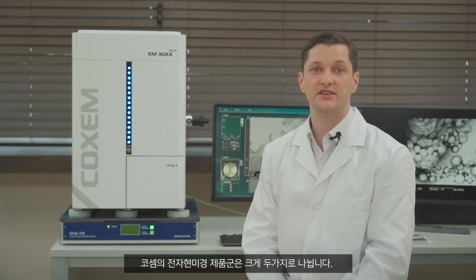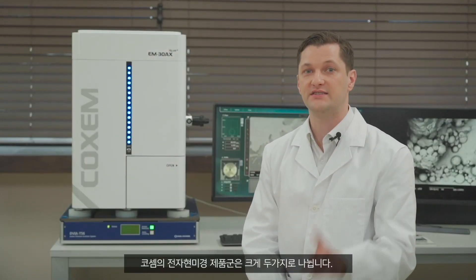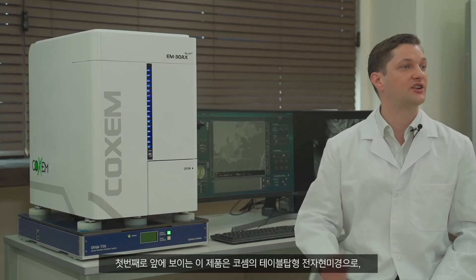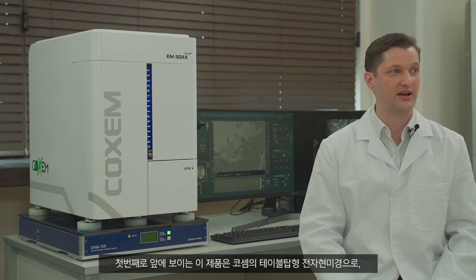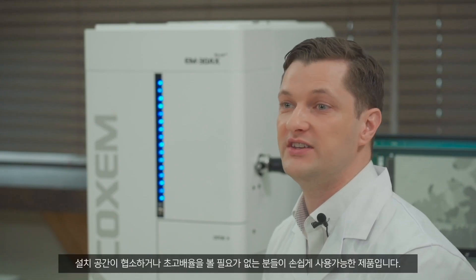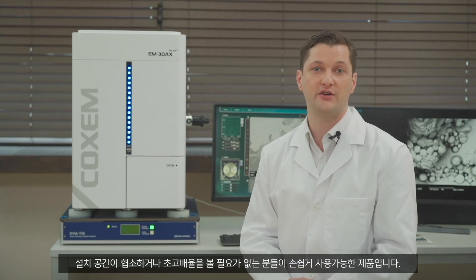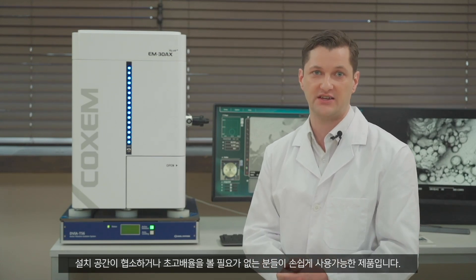The electron microscope products of COXEM are mainly divided into two types. First, the product you see here is the COXEM tabletop electron microscope, which is convenient when dealing with limited installation space or for operators who don't need to observe samples at high magnification.